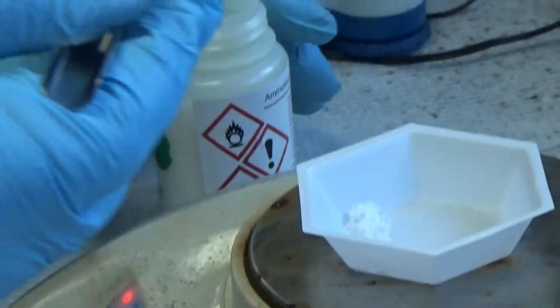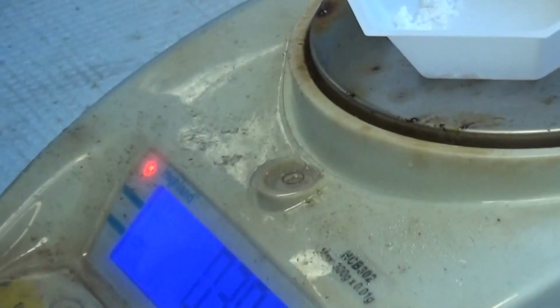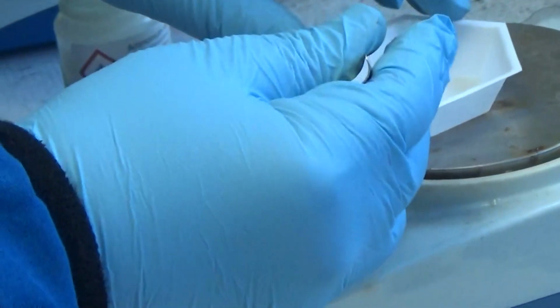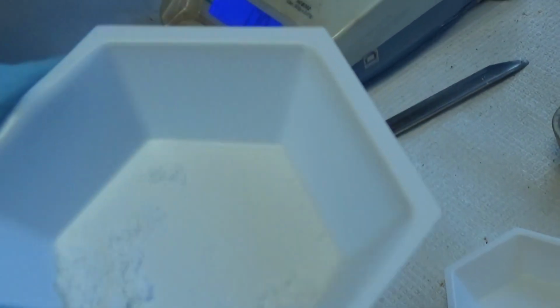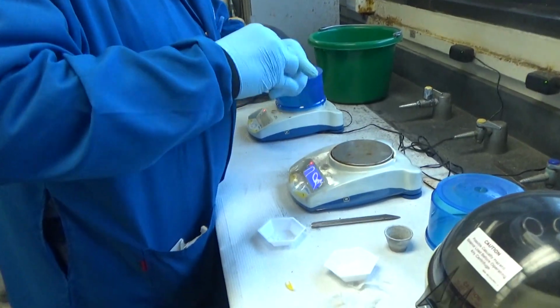Oops, that was too much. We're almost there, about 390 milligrams. There you go. Let's see where we are. 400 milligrams, a basically white solid. Okay, cool. I need to close that and cap it up.